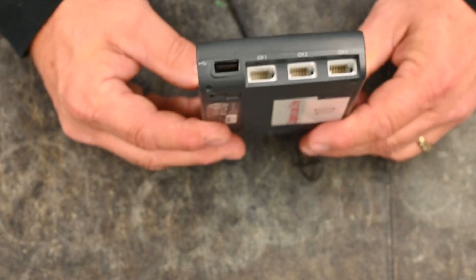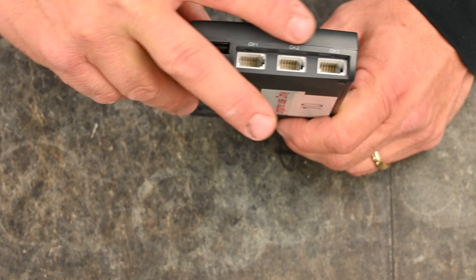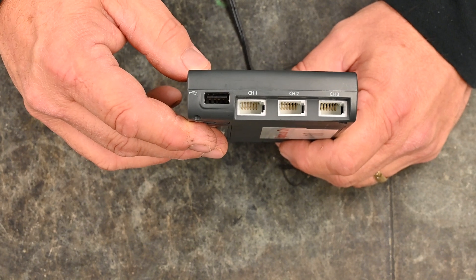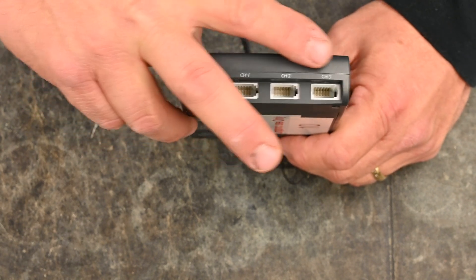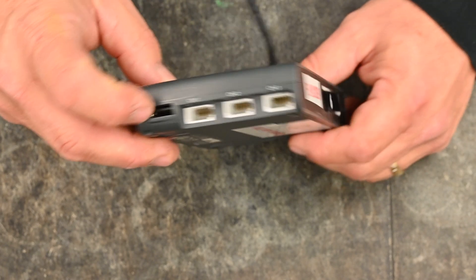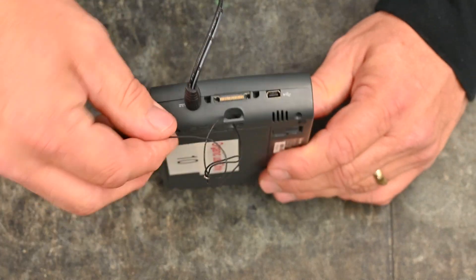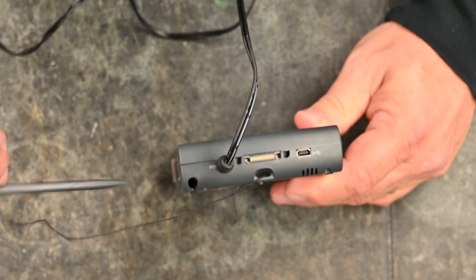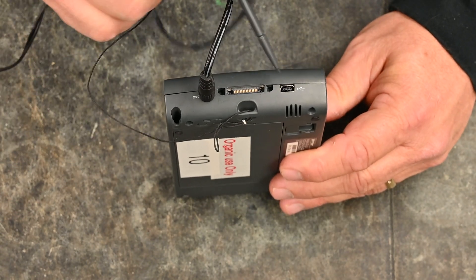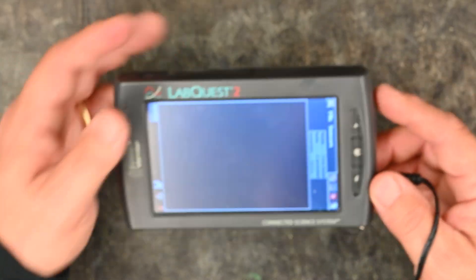If you flip it the other way, you'll see a USB port and channels 1, 2, and 3 — the analog plug-in channels for all the sensors we are sending you. On the other side there is a stylus that's nice to use when touching the screen. The remaining two ports are for power, which we won't worry about since we have it plugged into the wall.